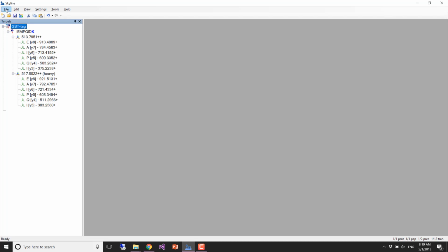Okay, so let's go ahead and import the data now. We'll just go File, Import, Results.